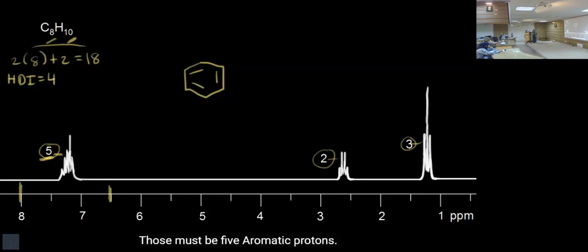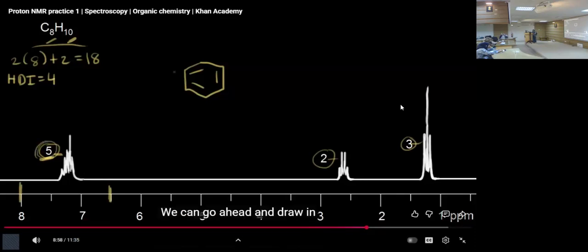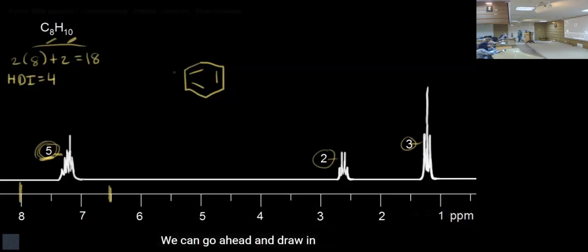Those must be 5 aromatic protons. I would like you guys to make a coupling tree in your notebook. Coupling tree.